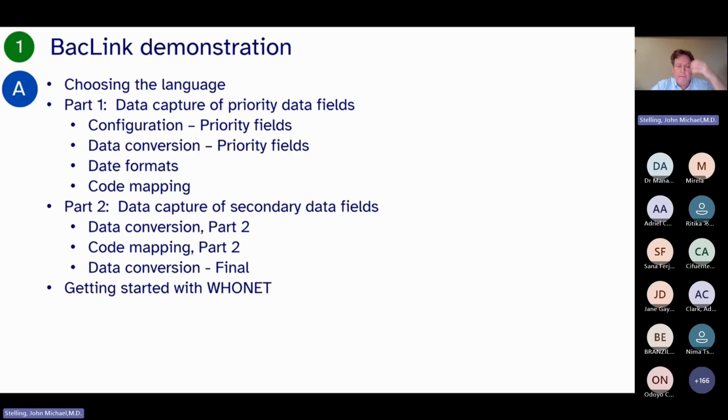But before going to WHONET, I'll go to part 2 and do some optional additional things that you may want to capture. It's a bit more advanced, which is why I separated it into 2 parts. Not only more advanced, it's also less needed. Most people don't use these additional features. I want to make sure through this webinar you feel somewhat comfortable with part 1 and part 2, just so that you know that it does exist.